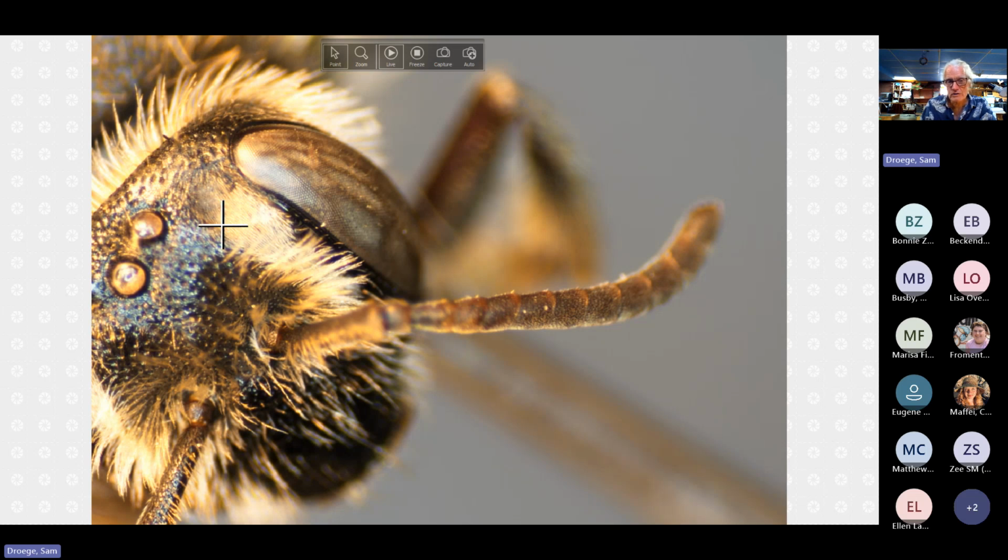Just so you know, for this species, the ratio of the upper part to the lower part is, I think we gave it as 0.2. In other words, there's not as much of a reduction in the facial fovea dimensions as you go further down. So even though they're still quite distinct from other species, which tend to just have a big sort of oval, there still are architectural elements that cut in. It's not as great as some of these others.